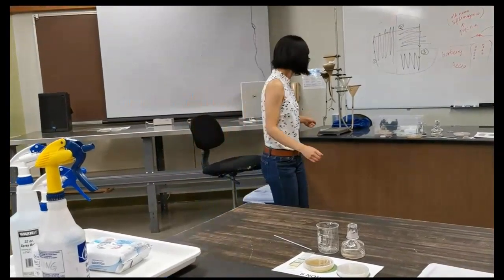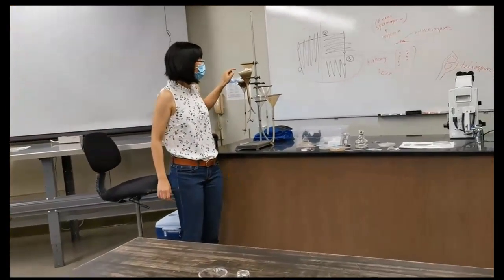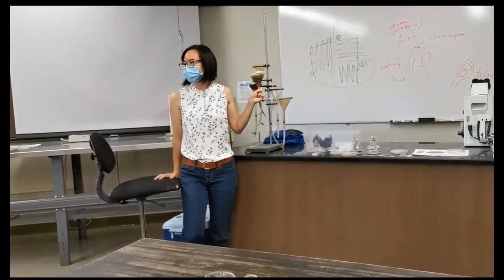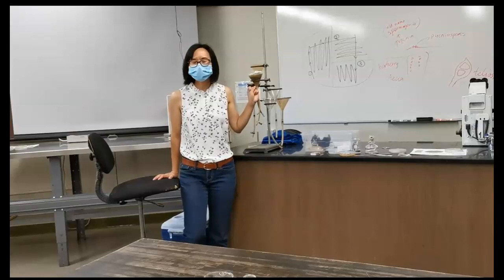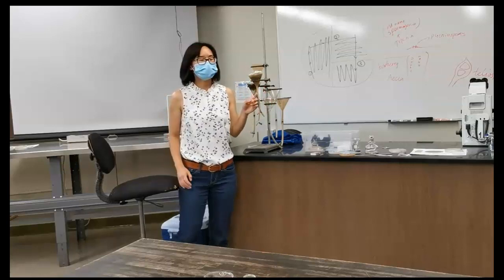So for nematode, I have set up everything, and you remember this. What's the name of this device? It's called Baermann funnel technique. So this is the most common way for nematode extraction.